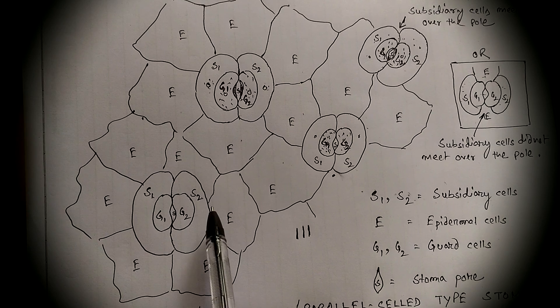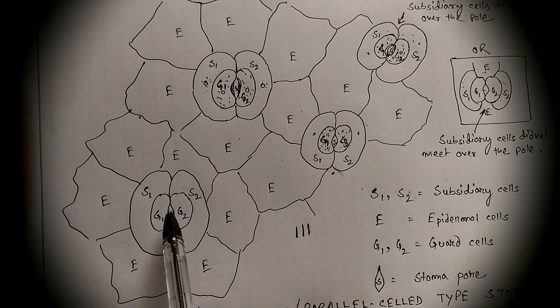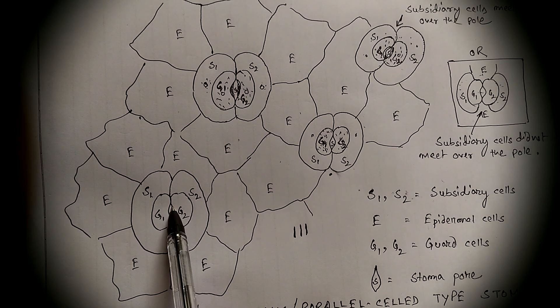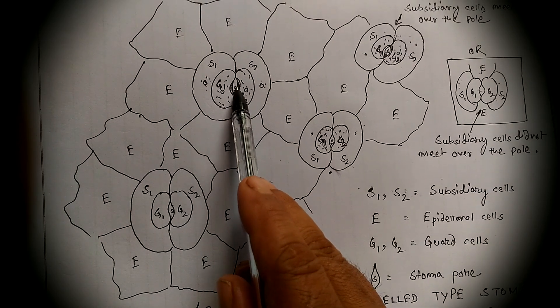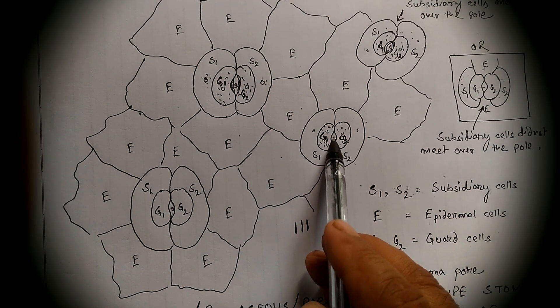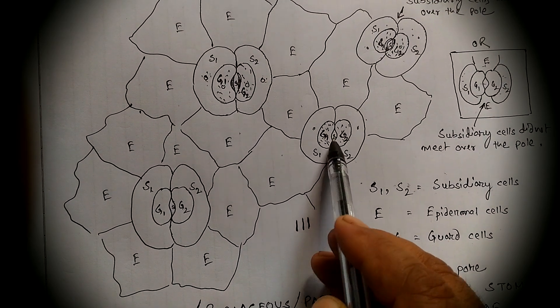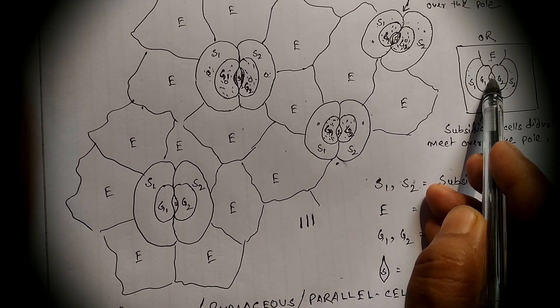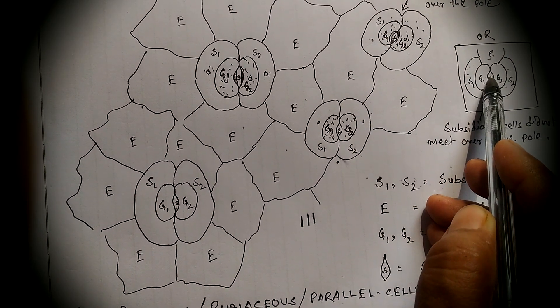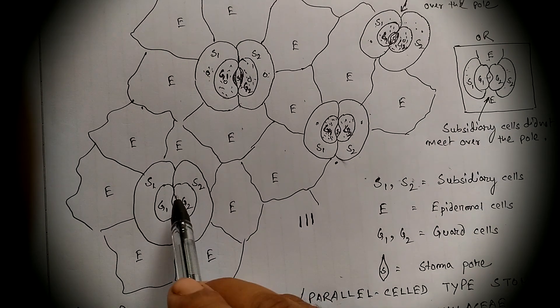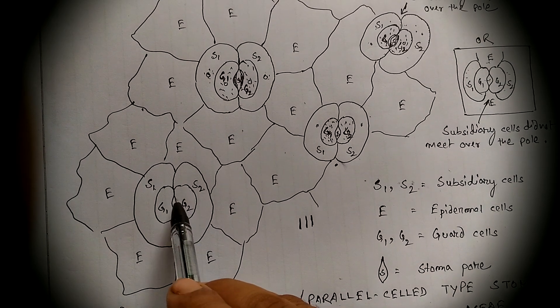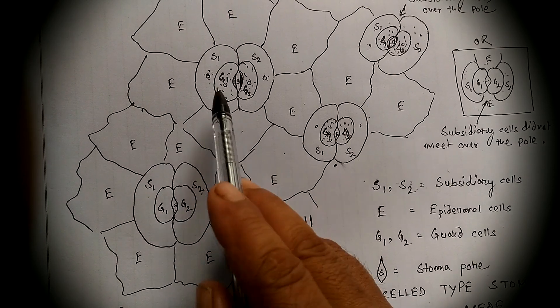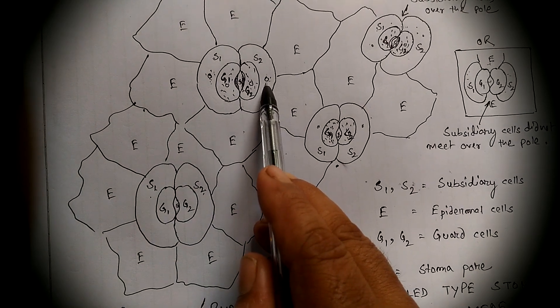This stomatal field shows multiple stomata — here is one stoma, here is another stoma, and even this one is a stoma. In each case, the number of subsidiary cells is 2.